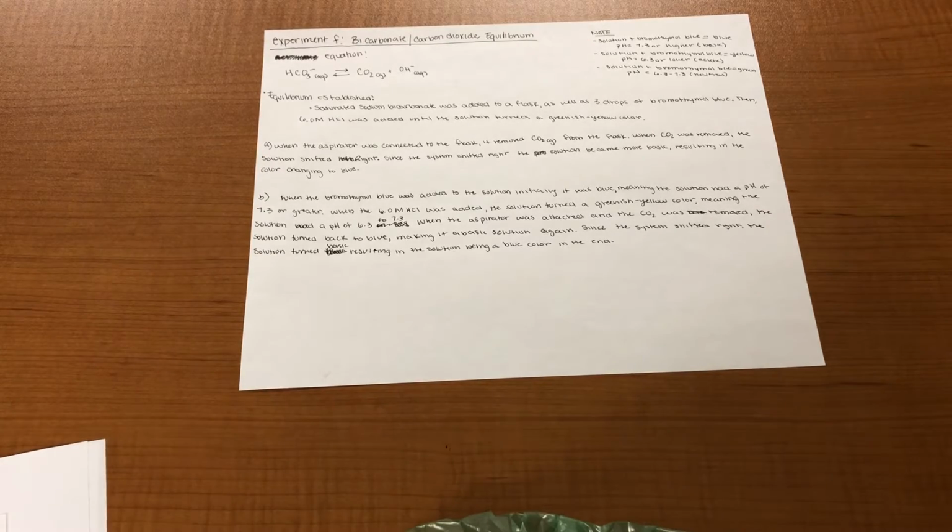greenish yellow color. When the aspirator was connected to the flask, it removed carbon dioxide gas from the flask. When carbon dioxide was removed, the solution shifted right. Since the system shifted right, the solution became more basic, resulting in the color changing to blue. When the bromothymol blue was added to the solution, initially it was blue, meaning the solution had a pH of 7.3 or greater.